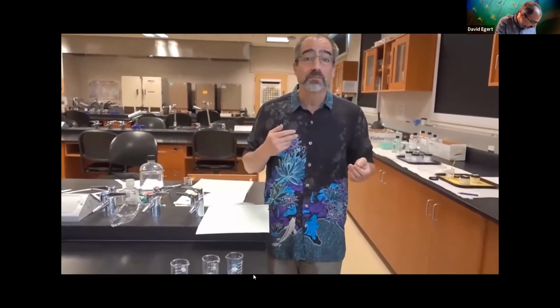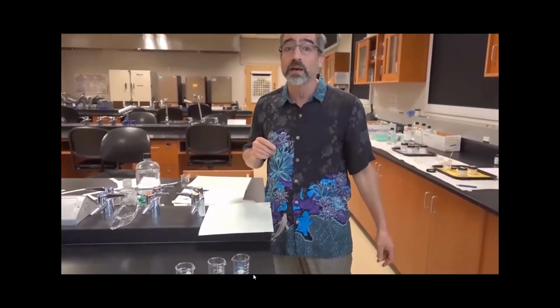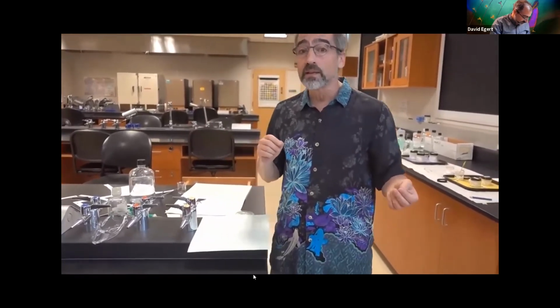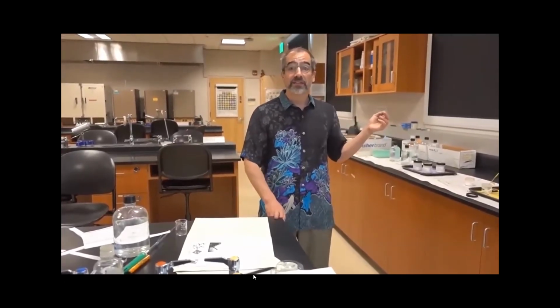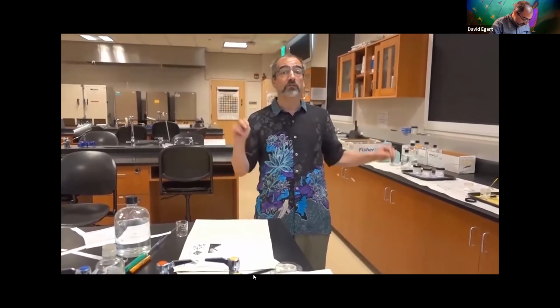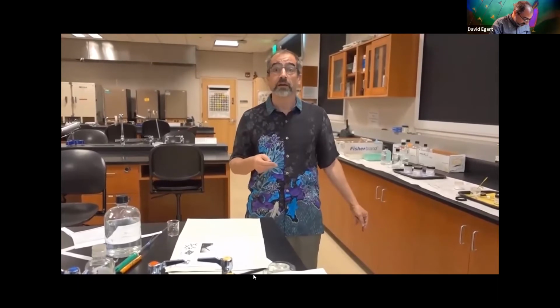Memory is pretty imperfect. You don't want to go back later and think, oh yeah, I think it was a white powder. That's not what your lab notebook is about. That's not what science is about. Empirical data is what you observe, so you need to record while you are observing it. The important thing about taking data is that you record what you actually see. Sometimes it's not what you expect, and that's still okay. You write it down. It's a true and honest record of your work, not what you would have seen in an ideal world or what you expect your teacher wants you to write down.